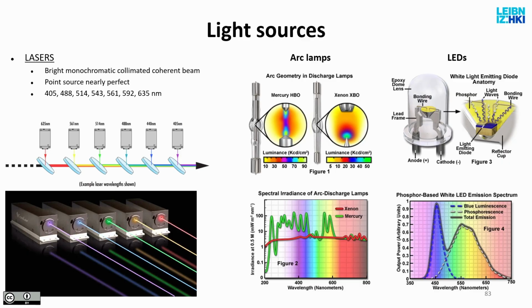Of course, the laser lines have to be aligned, so they run along the same path to hit the same objective and the same spot. For this one, by the way, it's 100% crucial that we use optical fibers, the one we showed at the second or third slide today. Without optical fibers, these beams would run in the open and it would be almost impossible to align them. But this way, we align them into the entrance of an optical fiber, and then all the wavelengths just run down the same optical fiber which is connected to the microscope itself.